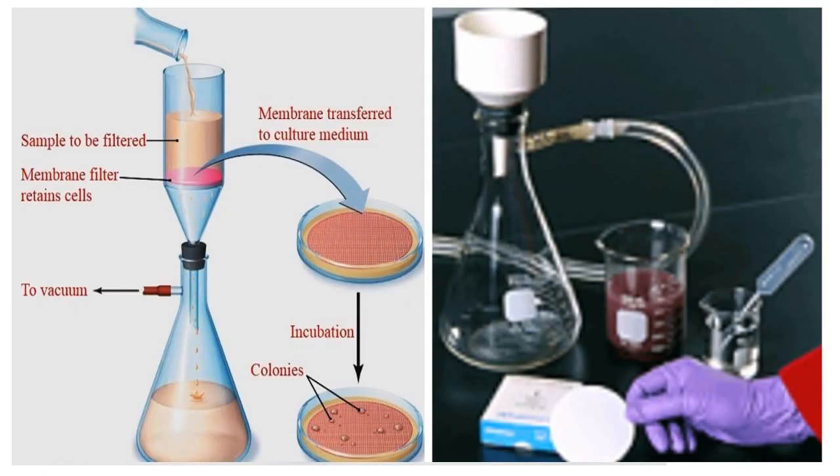Meanwhile, in the filter membrane method, bacterial cells are retained in the filter membrane, then the filter membrane is transferred to culture media for inoculation, to allow bacterial cells to grow in the form of colonies.